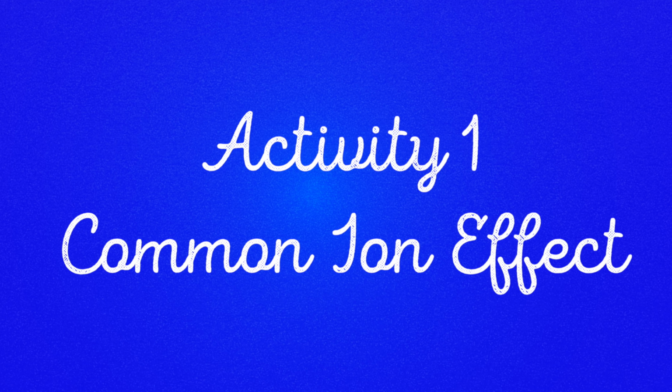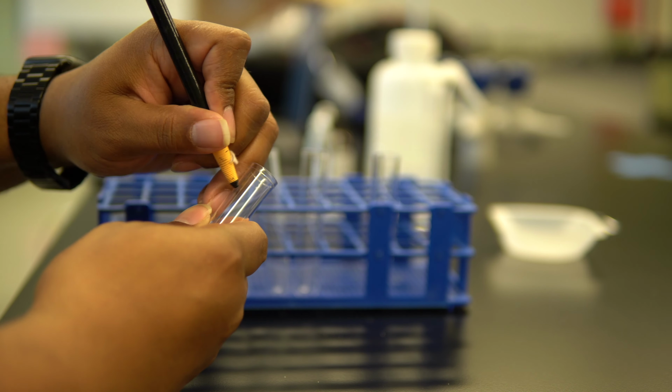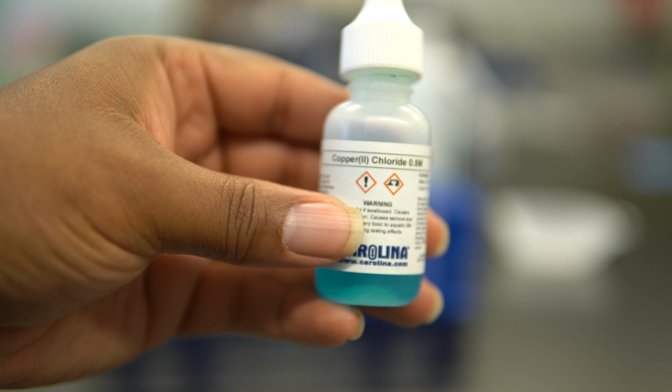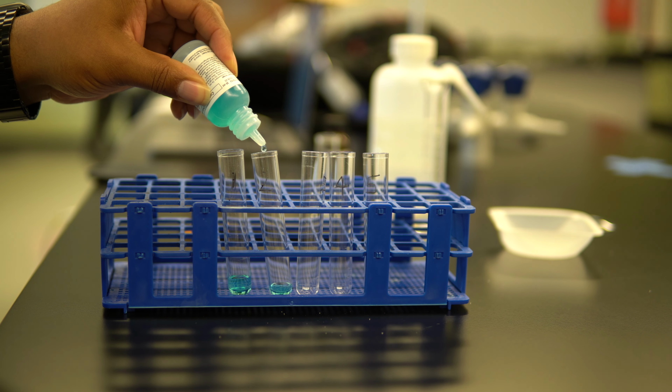Activity 1. Common ion effect. Use a grease pencil to number the test tubes 1 through 5 and place them in the front row of the test tube rack. Add 2 milliliters or 40 drops of the copper(II) chloride solution to each of the 5 test tubes.